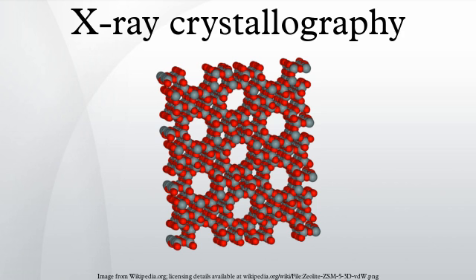Crystals can be marred by twinning, which can occur when a unit cell can pack equally favorably in multiple orientations, although recent advances in computational methods may allow solving the structure of some twinned crystals. Having failed to crystallize a target molecule, a crystallographer may try again with a slightly modified version of the molecule. Even small changes in molecular properties can lead to large differences in crystallization behavior.